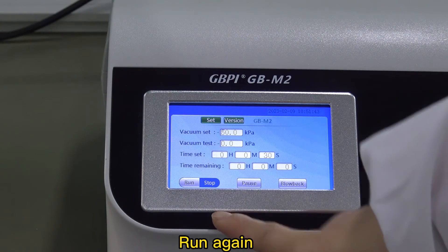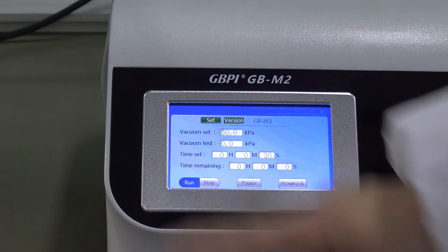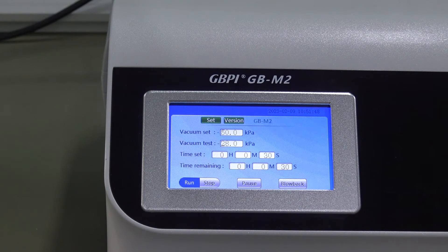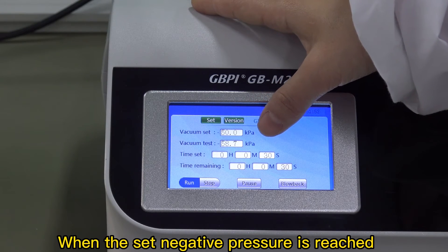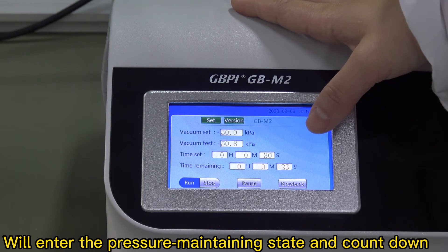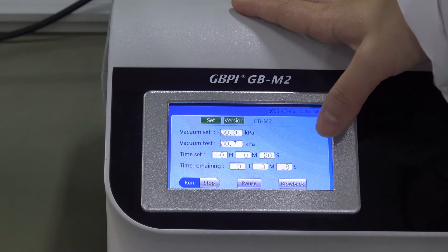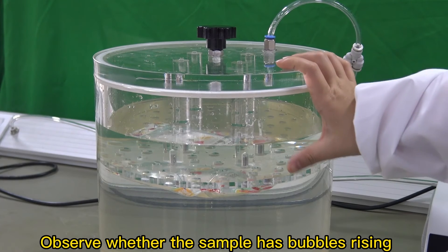Run again. When the set negative pressure is reached, it will enter the pressure maintaining state and begin the countdown. Observe whether the sample has bubbles rising.